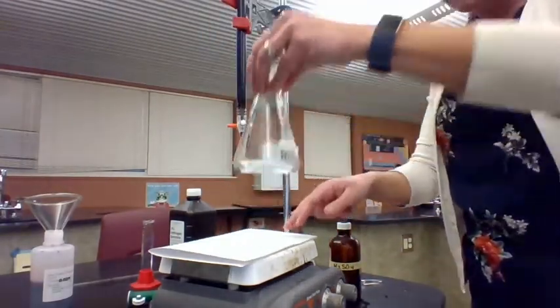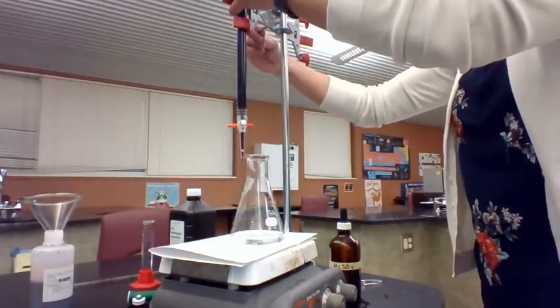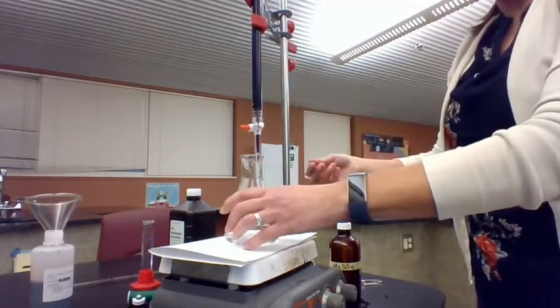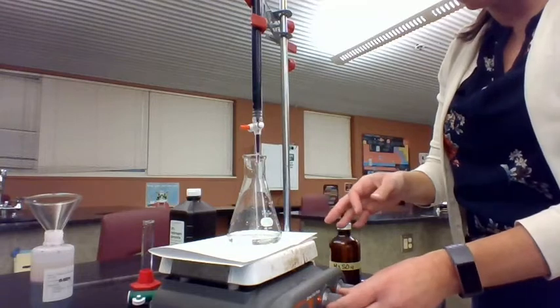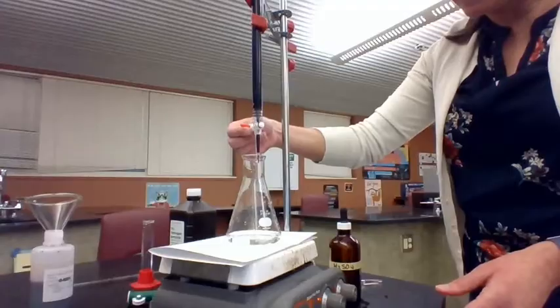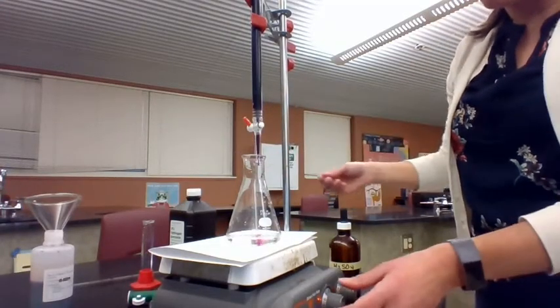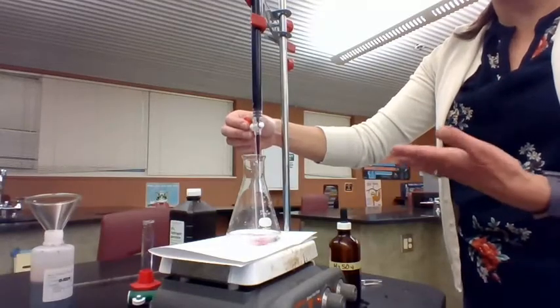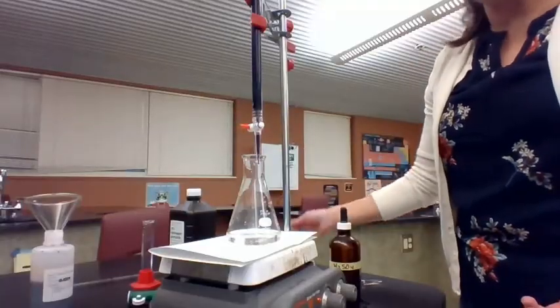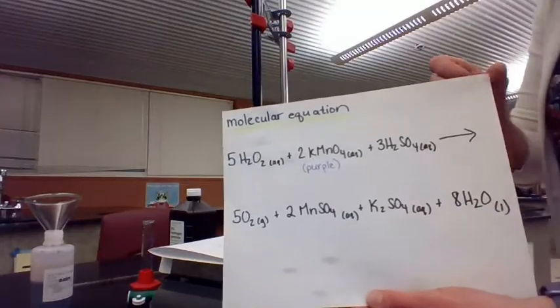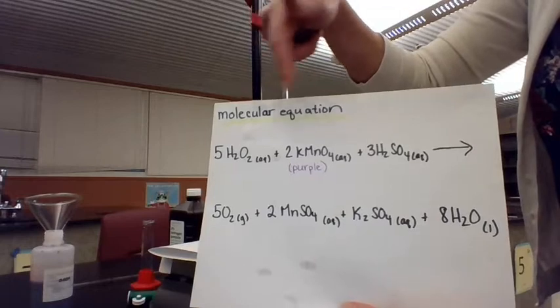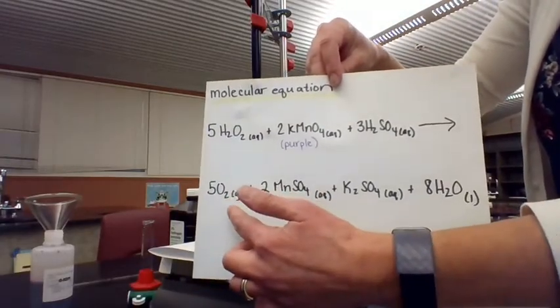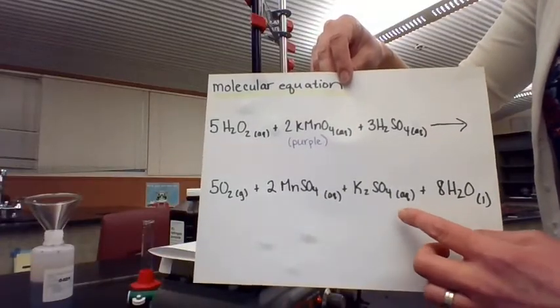Notice how this solution in the flask is clear, and then over here in my burette I have this bright purple solution. When we add our purple potassium permanganate to the solution in the flask, you see how the purple disappears? When my purple solution hits the flask solution, it turns clear. The reaction is: purple potassium permanganate is added to a solution containing hydrogen peroxide and sulfuric acid, and when they react they make oxygen gas — which may fizz a little — some manganese sulfate, some potassium sulfate, and liquid water.